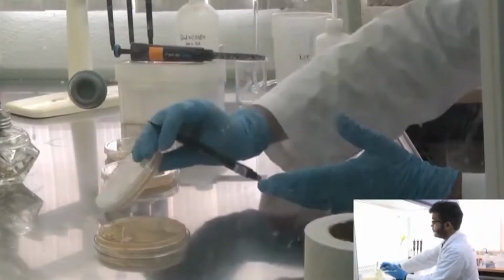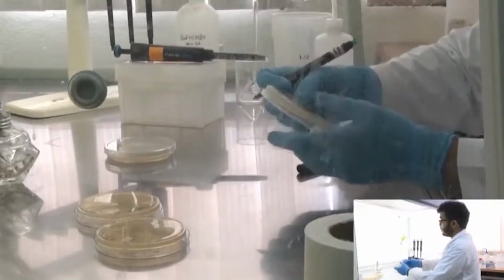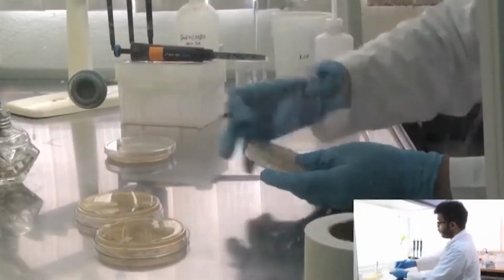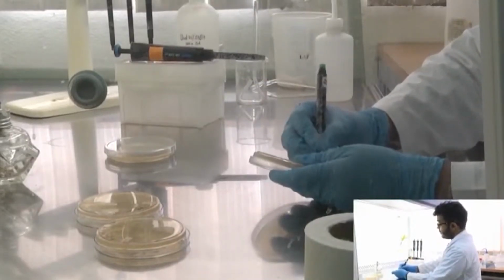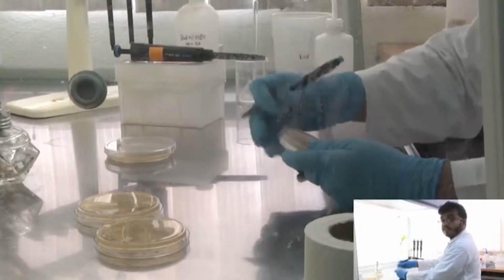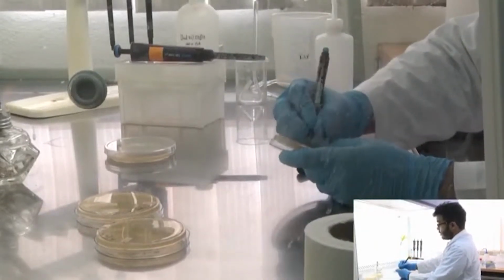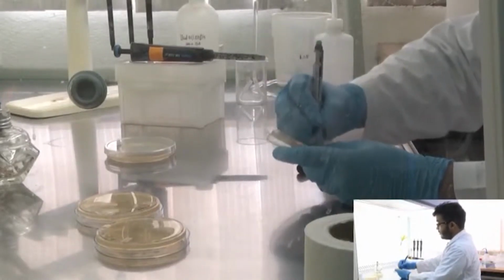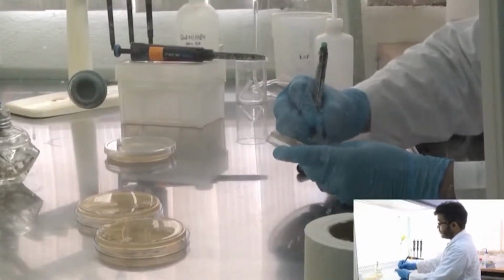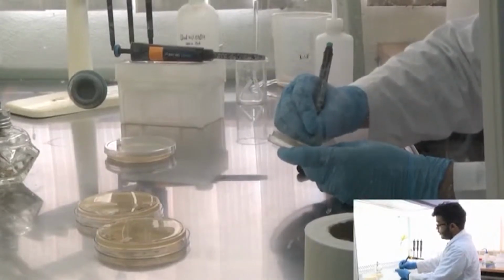Once 1.5 hours is completed, I am going to plate a small amount of culture from that onto these plates, and then we are going to leave these plates in the 37° centigrade incubator overnight, and by next day we are going to get bacterial colonies which contain our gene of interest.